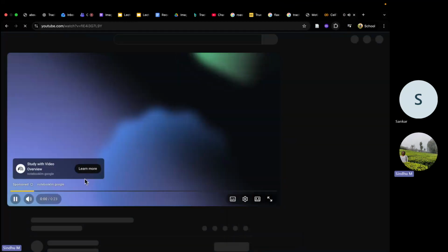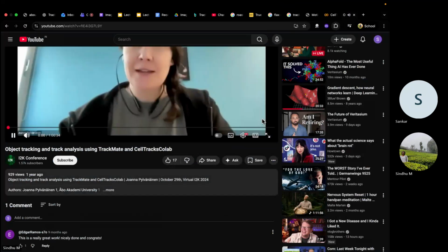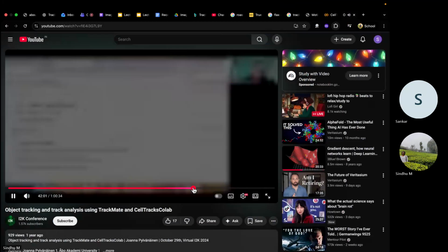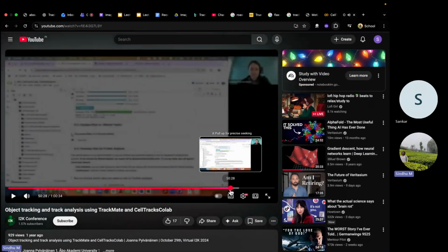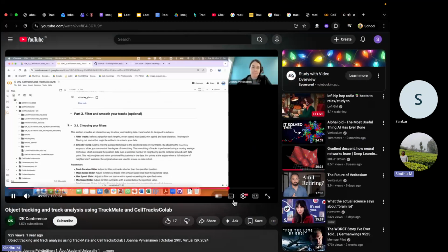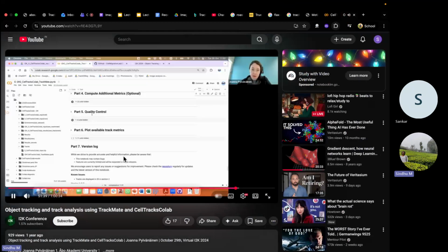So they also have a video, if you want. They're showing how to use their code and what the main analyses are that can be done. So it can draw tracks. Actually, I think it's all in the notebook directly.